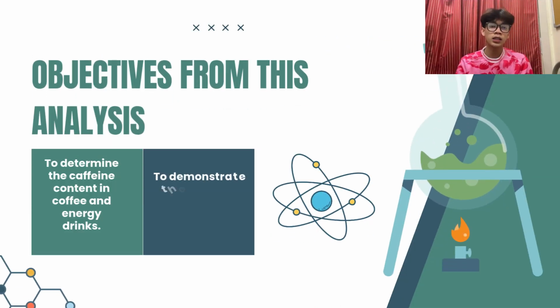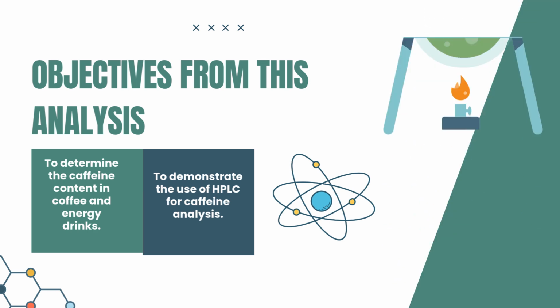Our objective from this analysis is to determine the caffeine content in coffee and energy drink and to demonstrate the use of high-performance liquid chromatography, HPLC, for caffeine analysis.